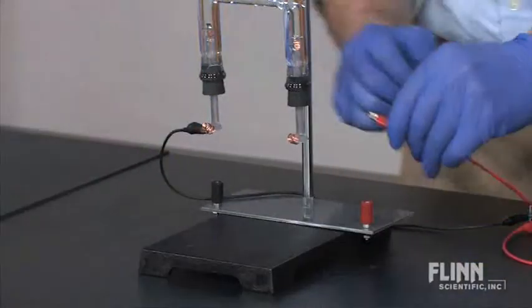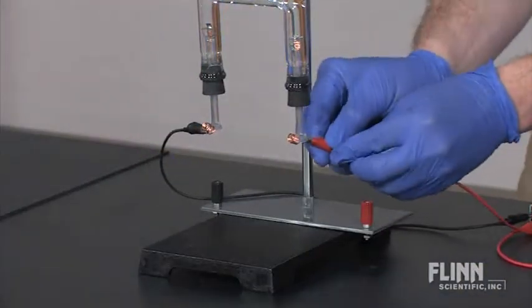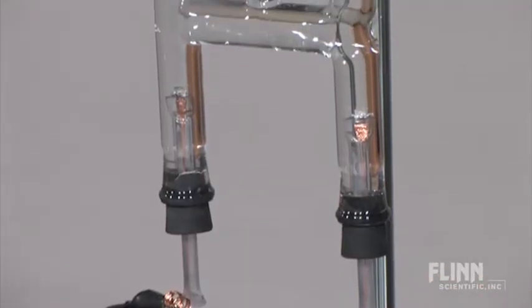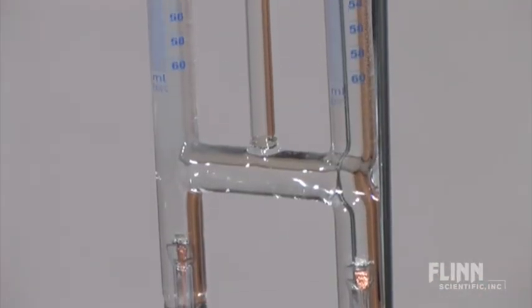Attach two platinum electrodes to a 9 volt battery or DC power supply and watch as oxygen immediately forms at the anode and hydrogen immediately forms at the cathode.